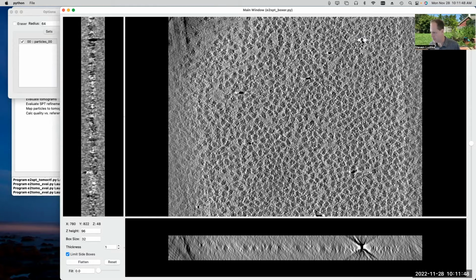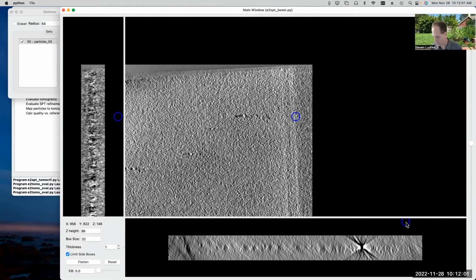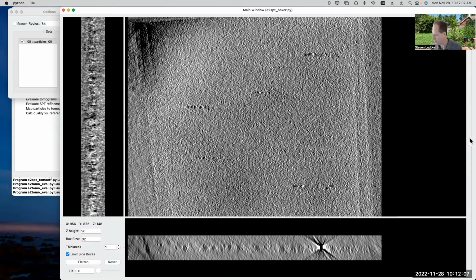Okay, so now you can see here's this fiducial, here's the fiducial here, here's the fiducial here. Sorry about the cat. All right, I've lost my position again now.